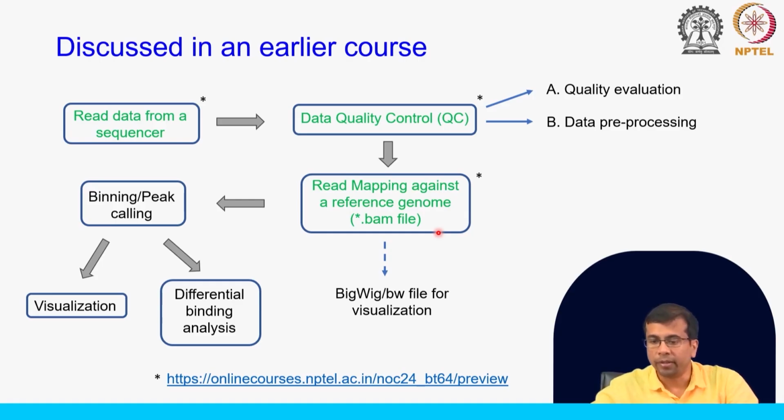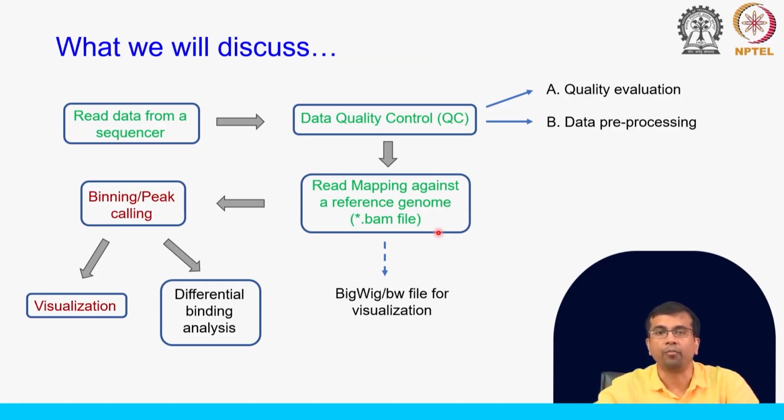What we are going to cover in this course are these 2 very important parts. The first part is the binning part and the peak calling part. So, we will start with the BAM file, and we will do the binning and the peak calling.